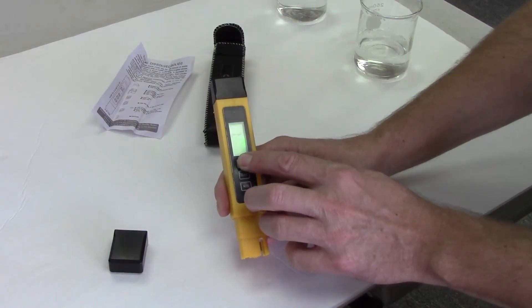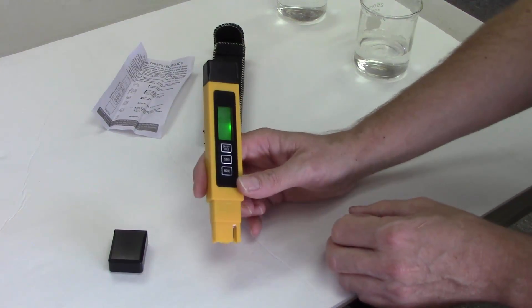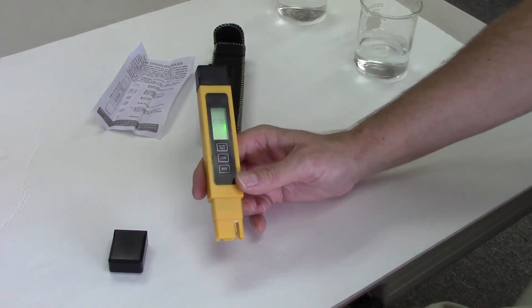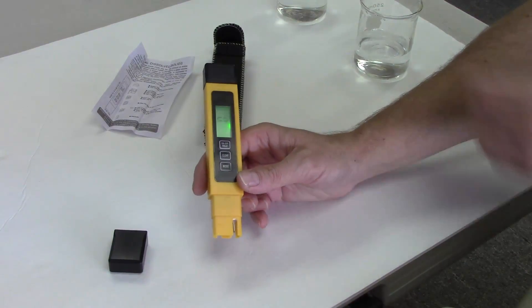When you press the on/off button, it's going to light up and clear out. It's going to say zero PPM, which is for total dissolved solids.